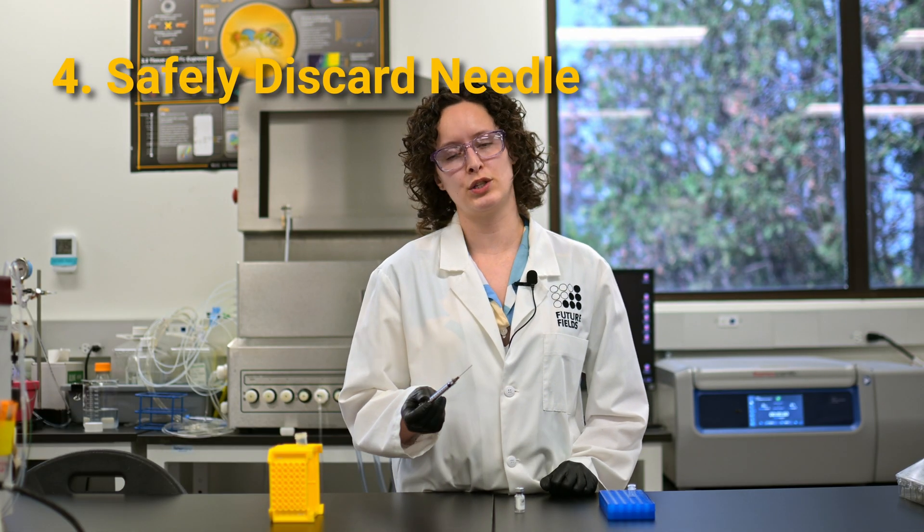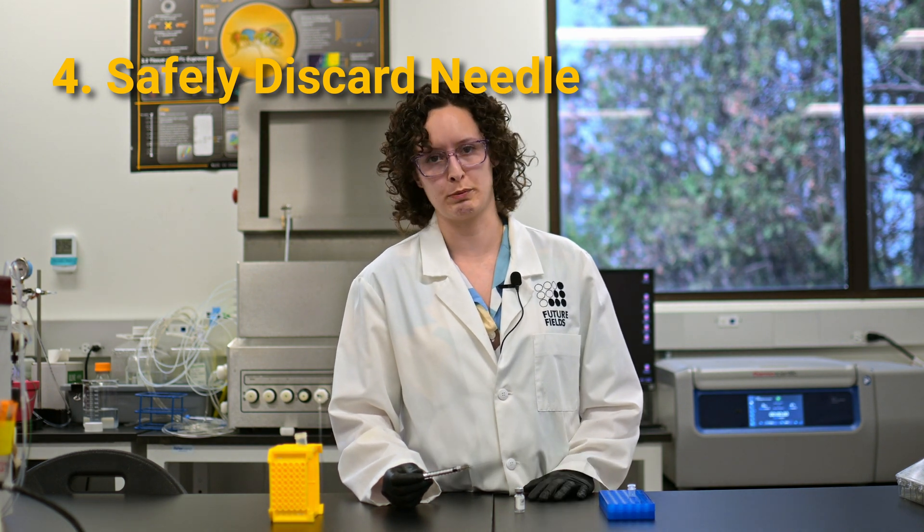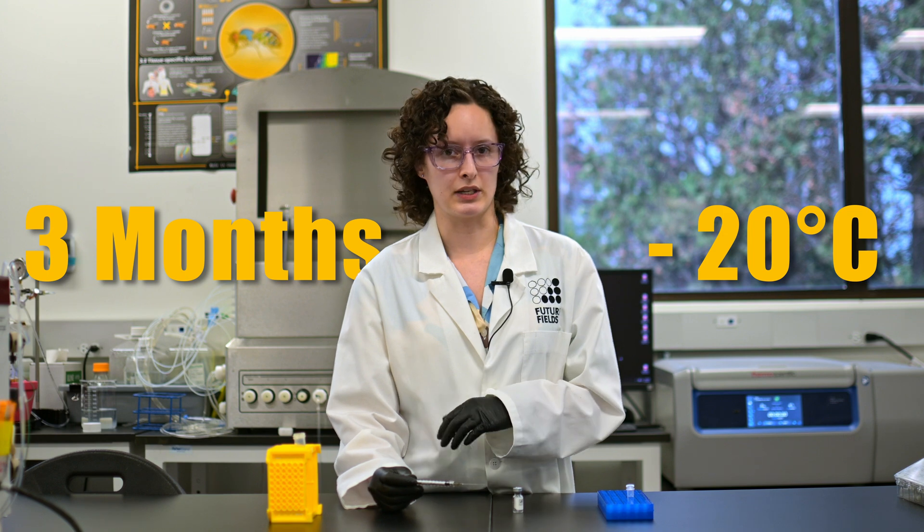Be sure to follow your institution's policies for safe handling of needles and discard the needle in a proper sharps container. Once you've finished working with your protein, you can store it for up to three months at minus 20, or whatever is recommended on your product-specific data sheet.